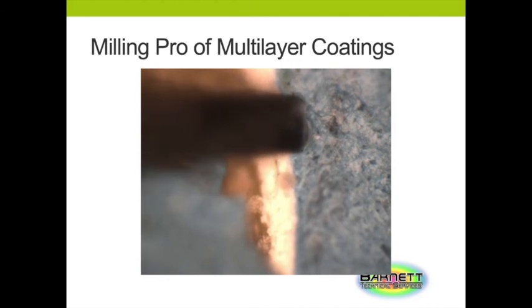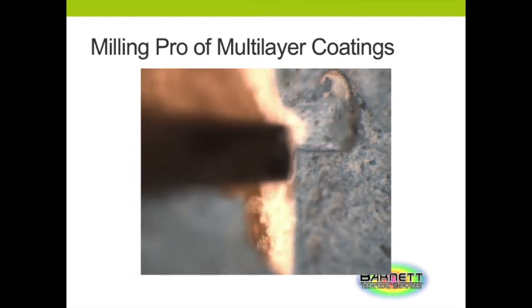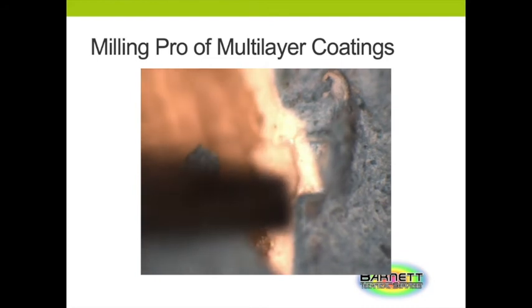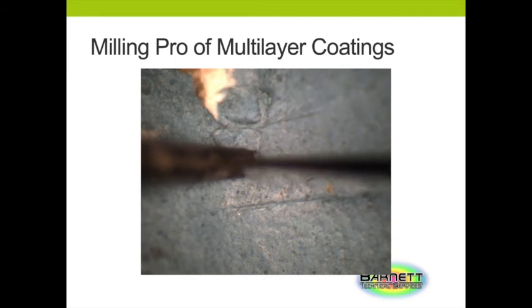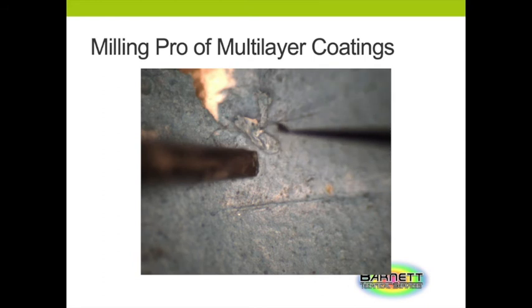In this case, that was extremely valuable because the surface polymer is not a very crystalline polymer. It's fairly amorphous, and so typically getting a smooth shaving can be difficult. In this case, you can actually see that we're able to shave off that upper surface. And I'm going to step through this video since it's about 6 minutes long. Once it's shaved off the surface, we can also use a second probe on the right side, which is just a tungsten probe, to press that grain between the two probes so that we can transfer it to the FTIR substrate.